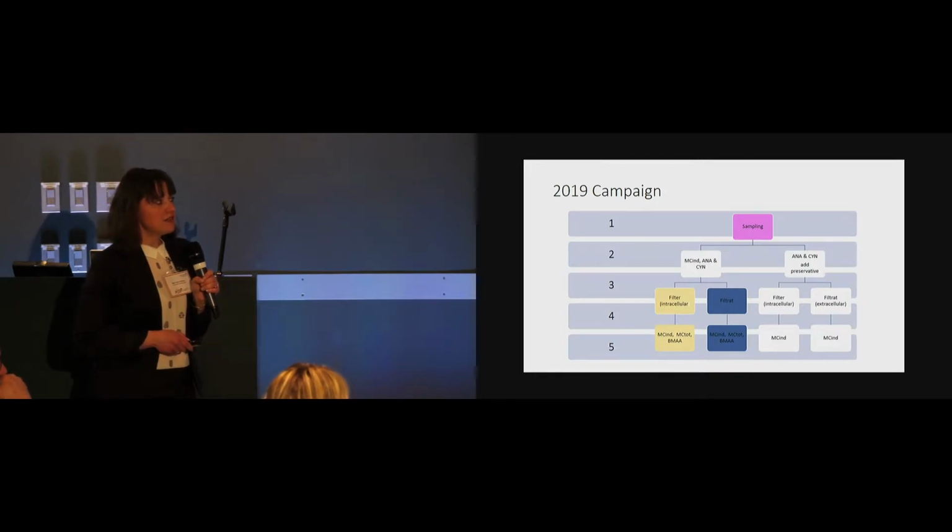But at the same time, we'd like to have the new sample taking with the preservative, and we'll do the analysis for the MC individuals with the new sample which contains the preservative, and we'll see if there is a difference. I suspect we'll probably analyze a higher quantity of anatoxin and cylindrospermopsin because we have added a preservative.